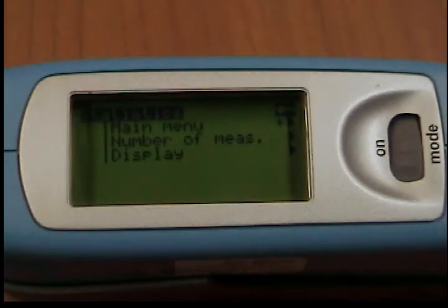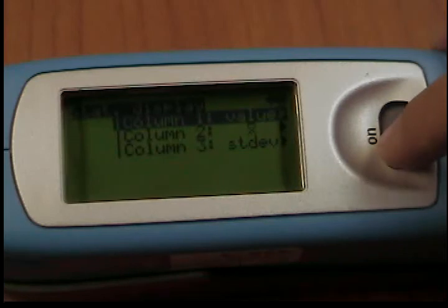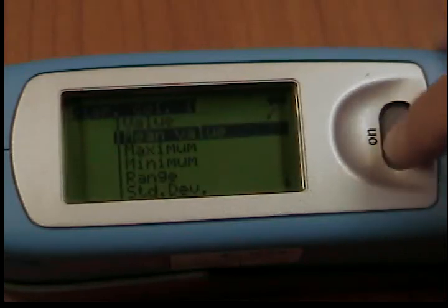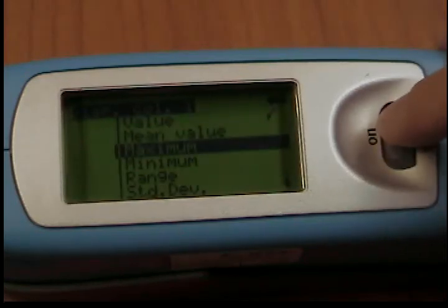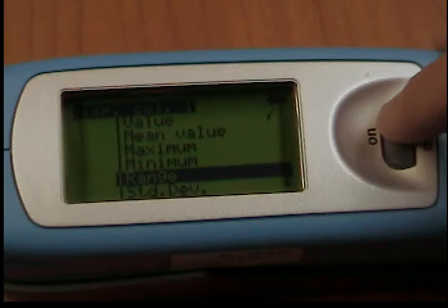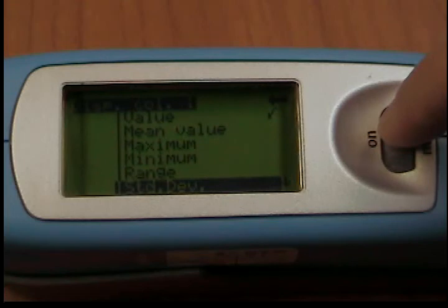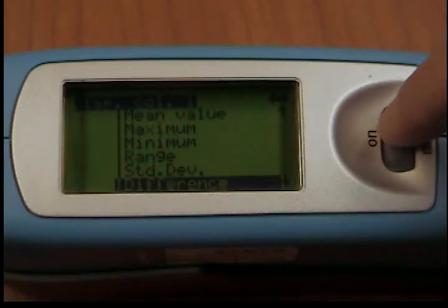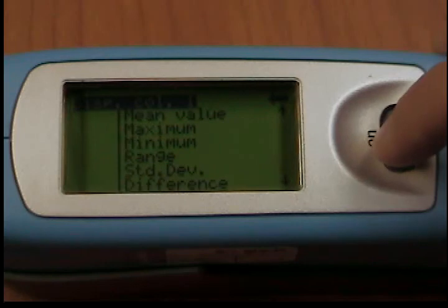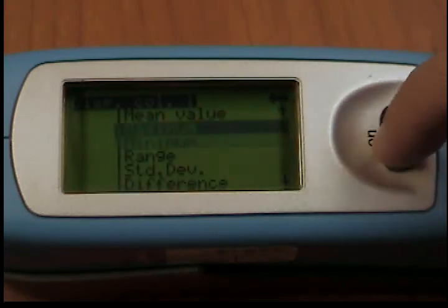On the Statistics Measurement Display, you can assign the following data freely to three columns: Last value measured, Mean value (arithmetic mean of the sample), Maximum (highest measurement value), Minimum (lowest measurement value), Range (difference between maximum and minimum), Standard deviation, Difference (between the sample and the target value), Pass/Fail (passed if within specified limits, fail if outside), or Off (turns the display of the selected column off).